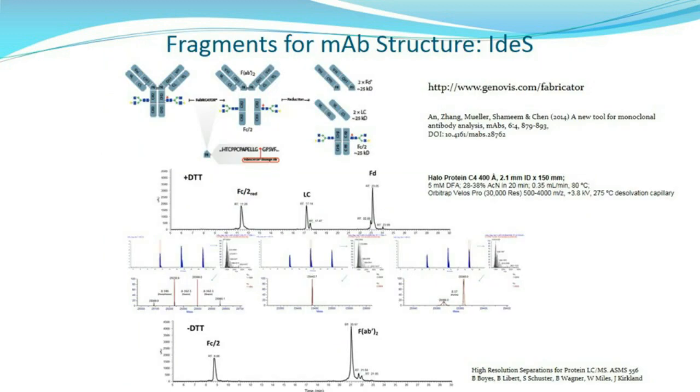Same thing can be done in terms of high resolution mass spectroscopic data and high performance separations for the more recently popularized use of IdeS protease in order to characterize glycosylation and primary structure variants in monoclonal antibodies. This is becoming a fairly standard methodology.